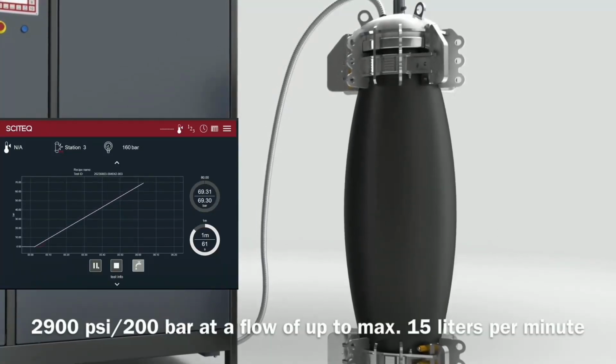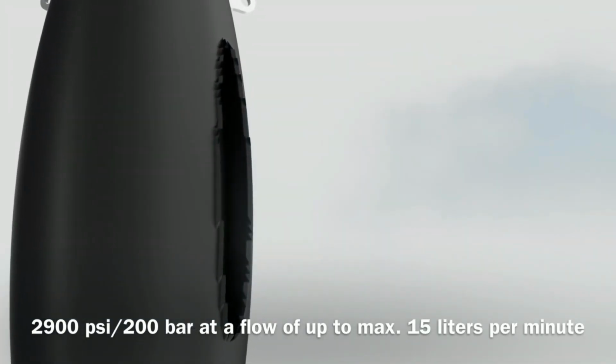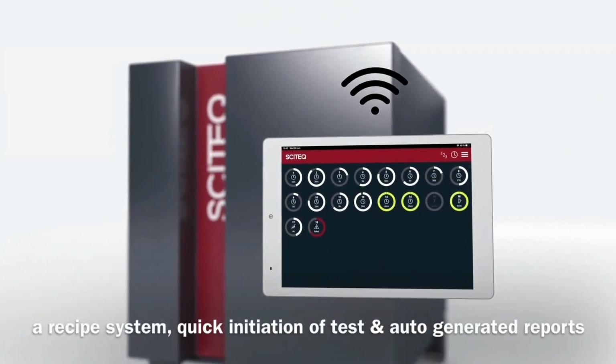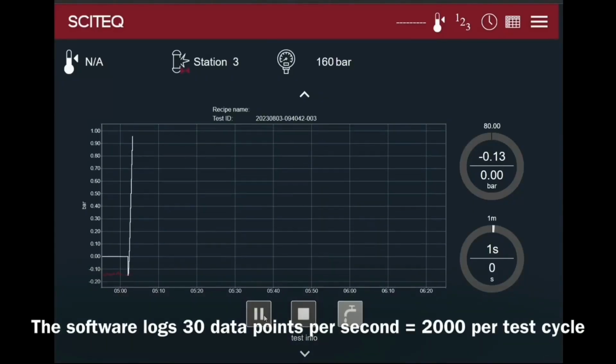burstONE is controlled via the user-friendly wireless interface, offering multiple advanced features such as a recipe system, quick initiation of test, and auto-generated reports. The software logs 30 data points per second, 2,000 per test cycle. With burstONE, you get best-in-class regulation and flow.